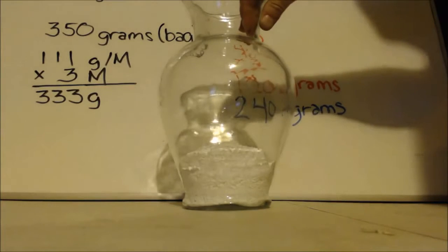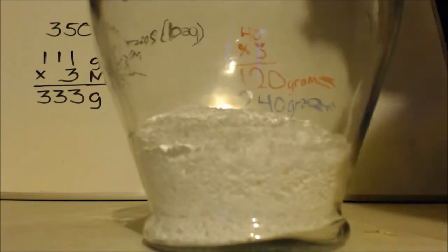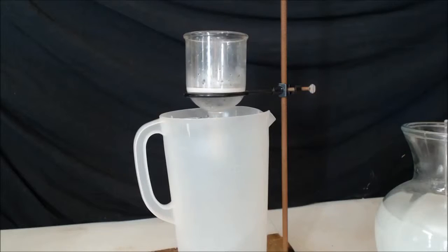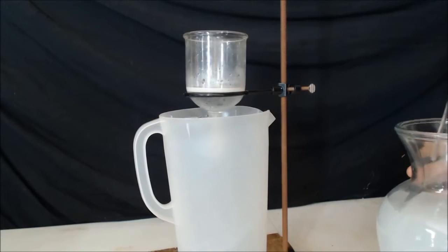Right here I got 350 grams of DampRid. I'll get some hot water, put it in there, and let it dissolve. All right, I'm tired of waiting for everything to dissolve, so I'm going to filter this.